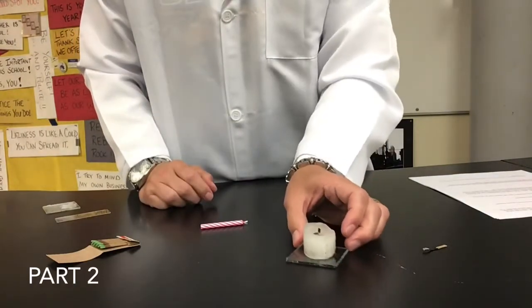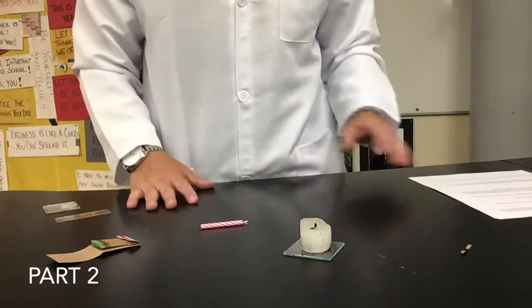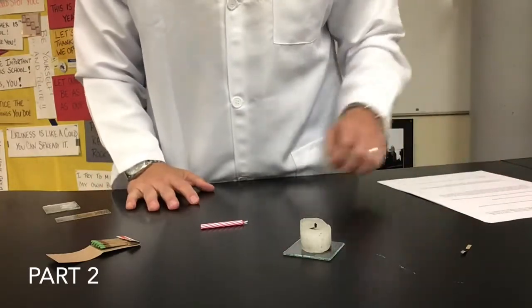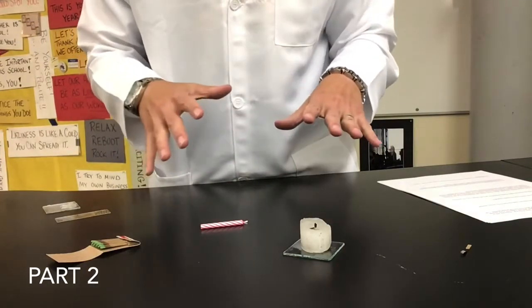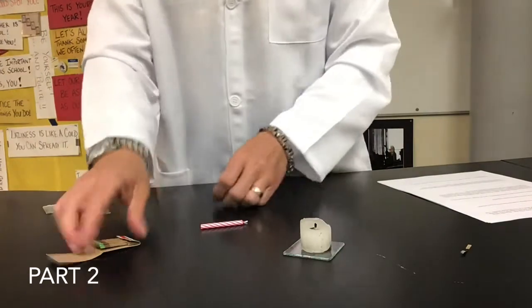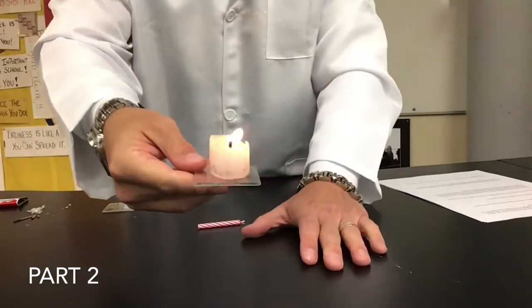Part of the lab now says simply to light the candle and let it burn a few minutes. When you do that, you're going to watch it and list any changes that occur in the candle. So let's light this up. So we've lit our candle and we've been letting it burn for several minutes.